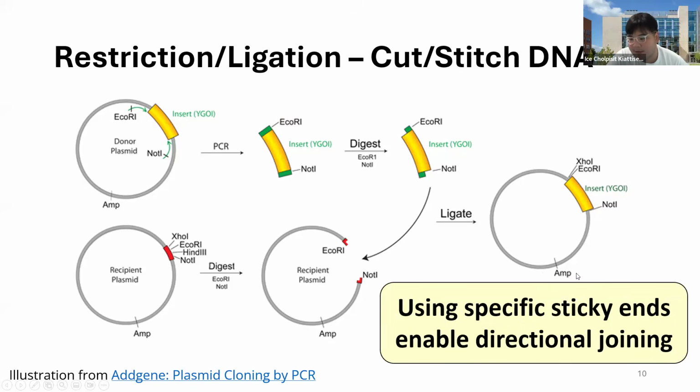So this one would be based on the sticky ends. That's the specific word we use for these restriction ligation processes. Some of the restriction digests will generate a blunt end, and that will give you a different kind of design strategy for doing these molecular cloning processes.